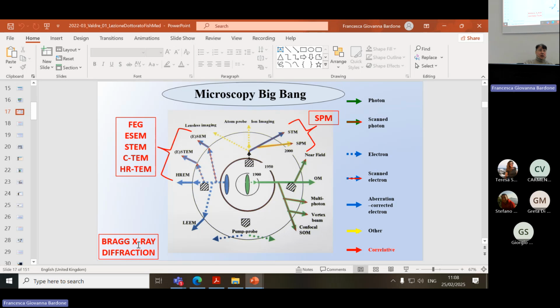So if your wavelength is a micron, you cannot see nanoscale objects, like in optical microscopy. So if I introduce diffraction, because diffraction in physics is a limit for you to understand which kind of microscope instrument you should use for your specific application. The second reason I introduced diffraction, because in the last part of my lecture today, I will change completely to another method.